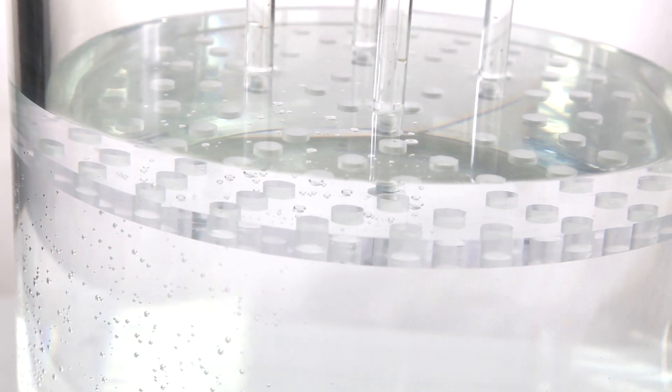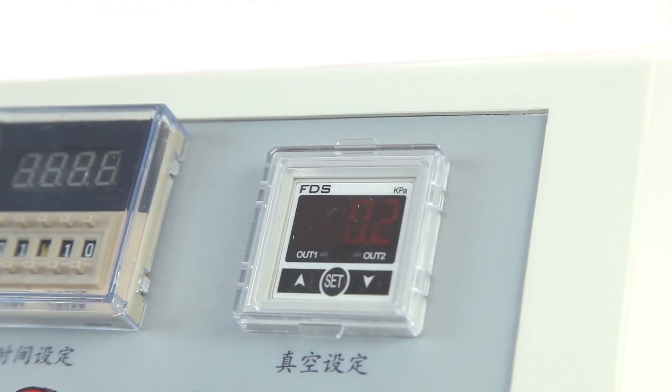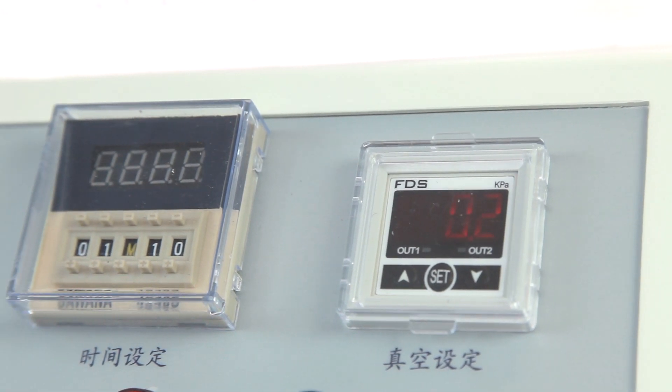By this test the user can evaluate the hermetic sealing quality of packaging bag or container.